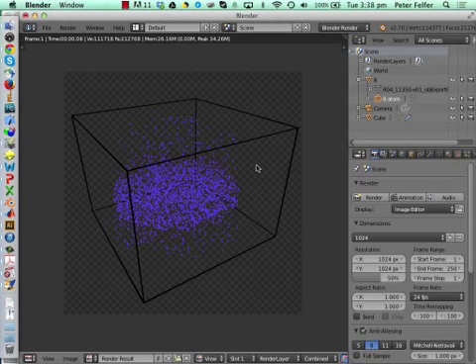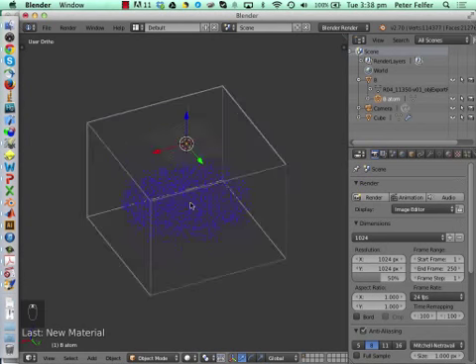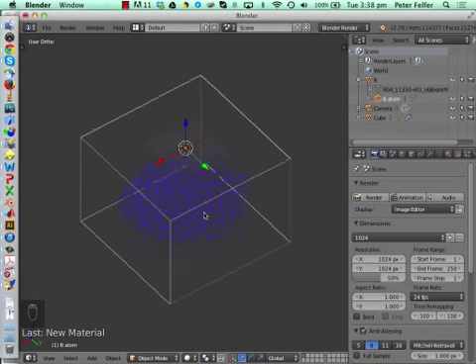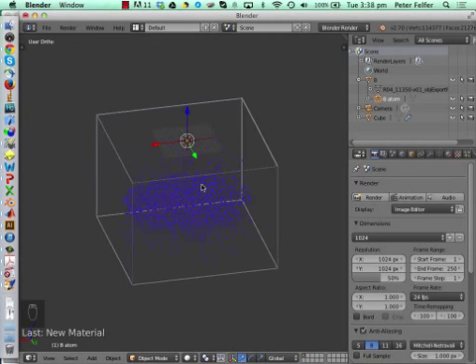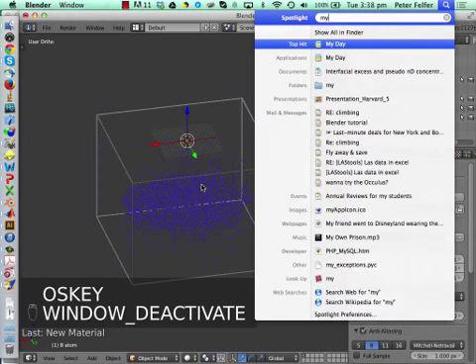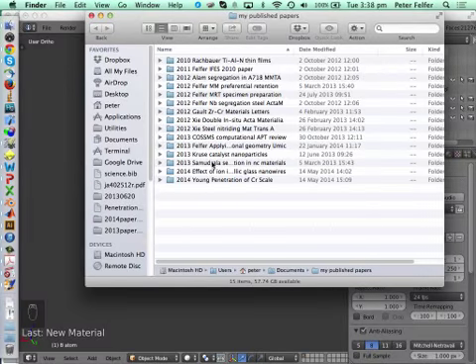The other way of visualizing your data with Blender is using a halo material, which means we're rendering the mesh out directly without the vertex duplication, which is a faster way, and sometimes I consider it, especially if you want to make it look very two-dimensional. If you do slices out of material that is not supposed to look very three-dimensional, I consider it a much better option. I think in one of the recent papers I've used that.